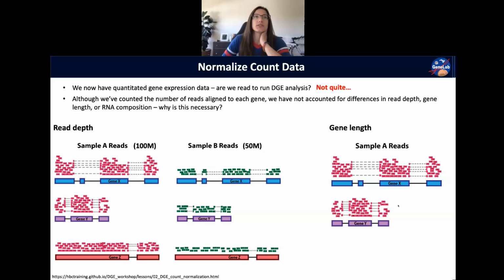Yes, Hannah Lee, yes. So if you want to look at just sample A, let's say, and you want to know if gene X is more highly expressed or gene Y is more highly expressed, now you absolutely have to account for gene length, because now you're comparing within the same sample here. And so if we have 100 reads here mapping to gene X and 100 reads here mapping to gene Y, that does not mean that gene X and gene Y are equally expressed, because gene X is a lot longer, so the likelihood of you getting a read from even just one copy of this transcript is going to be a lot higher. So yeah, when you're doing within sample comparison of gene expression, you do need to account for gene length.